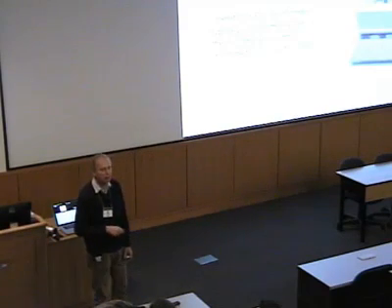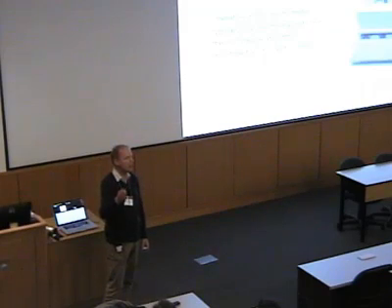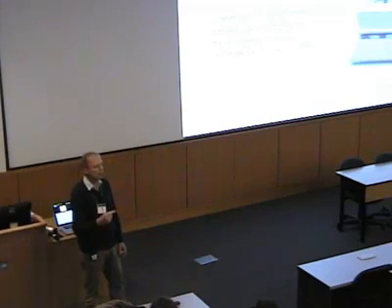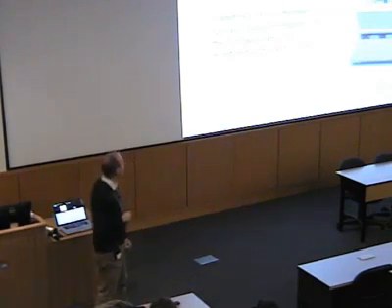So in a typical absorption experiment, we would take the wavelength or the frequency of our light and sweep it and find the places where it absorbs. In this experiment, we do things the other way around, and we take the energy levels that we're trying to measure the transitions between, and we move them up and down until they match the microwaves that we're using.